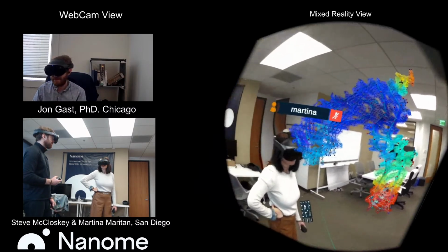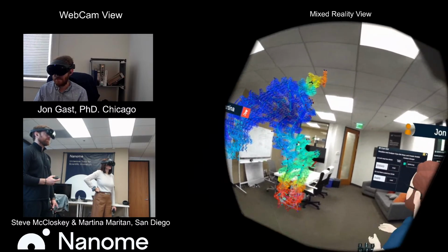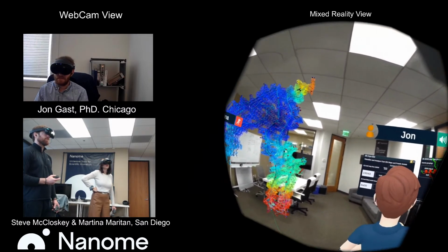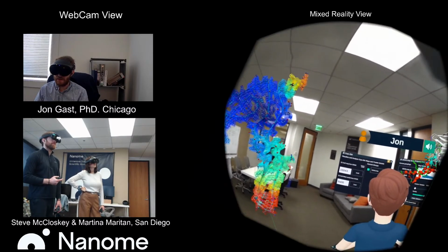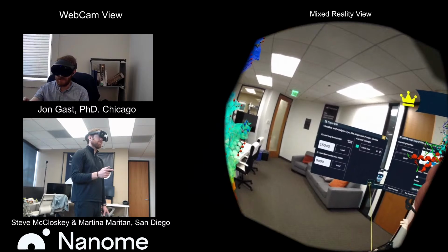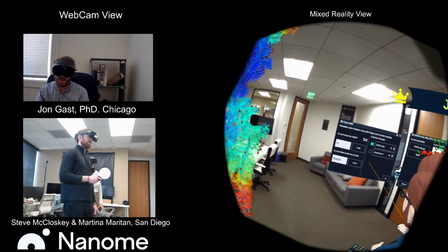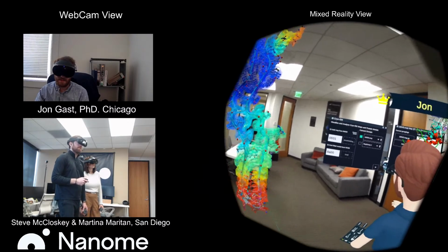Can the plugin handle multiple maps and models simultaneously and enable comparison between them? Yeah, so let's look right here. We've got this plus sign down below. I was looking at a different prion before, 0931.